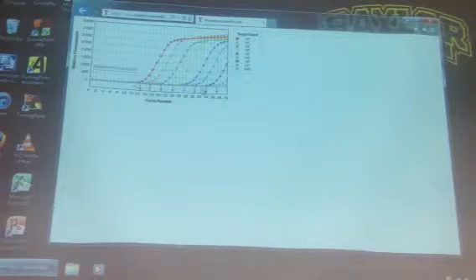Okay? So the only thing you have to do is make a standard curve, which this is, and then you have to decide where you are going to measure the cycle number. You can measure the cycle number right here at 500, or you can measure it down here at 100, whatever. You choose where you're going to measure that cycle number, then you drop the arrow down and say, okay, that's the cycle number. And that's how you make a curve between the target input, the number of molecules, and the cycle number. And then you wind up with a nice, pretty graph.